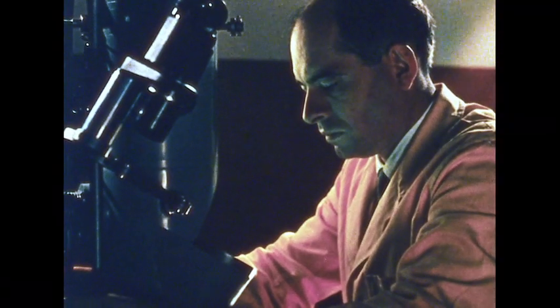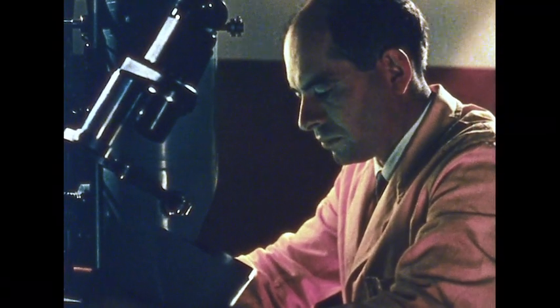Magnification on the microscope screen, 36,000. On a 10-foot wide cinema screen, 1.5 million. By taking a picture with the built-in camera and enlarging the photograph, magnifications of 2 million times or more are possible. The prints are known as electron micrographs.